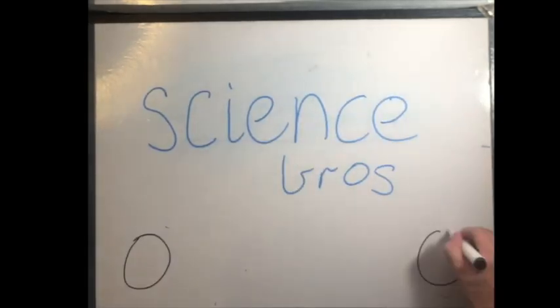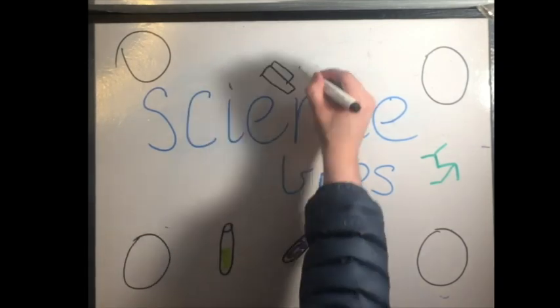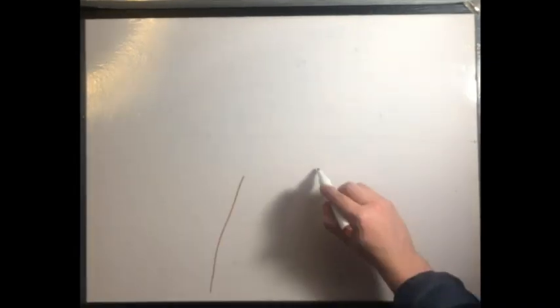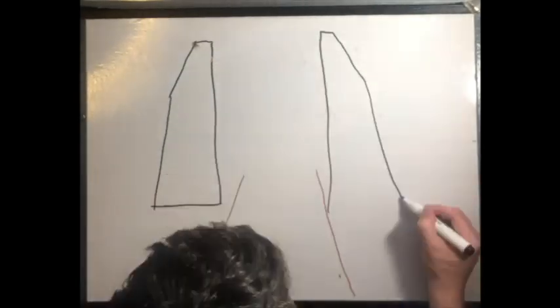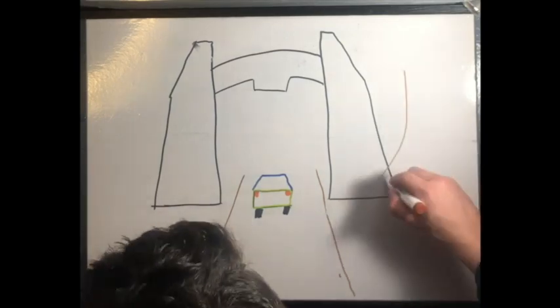I'm Oscar, and here with me today in voice we have Alicia, Sarani, and Sam. Tonight we're going to be guiding you through the process known as recrystallization. I know it sounds complicated, but with the help of my compadres, we're going to guide you through it with some neato visuals to make sure that you at home can follow along.